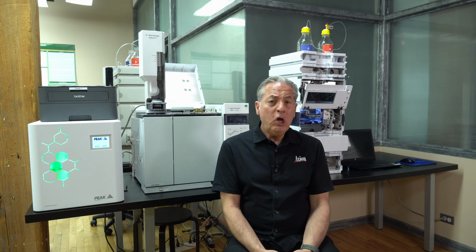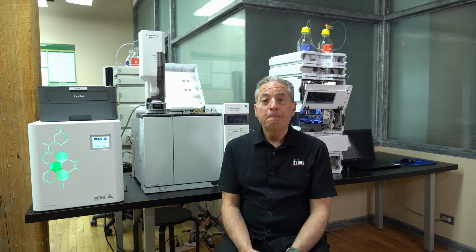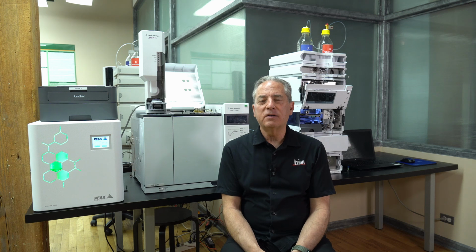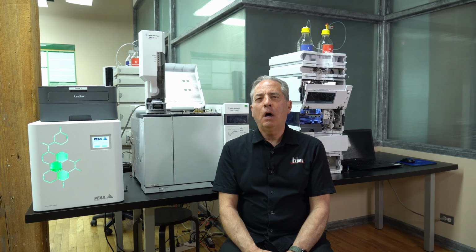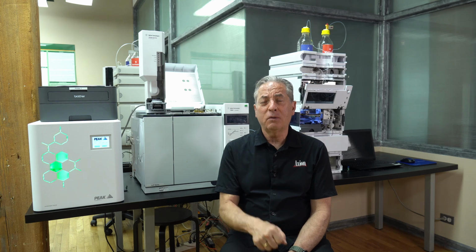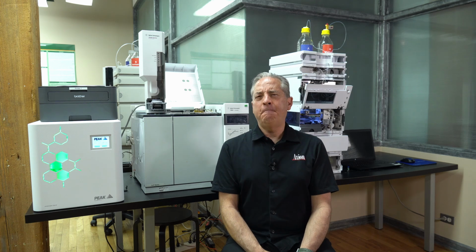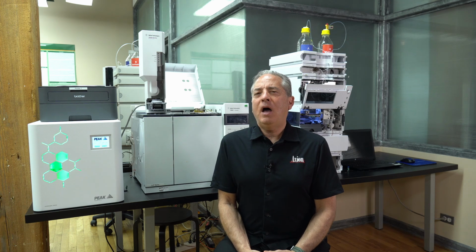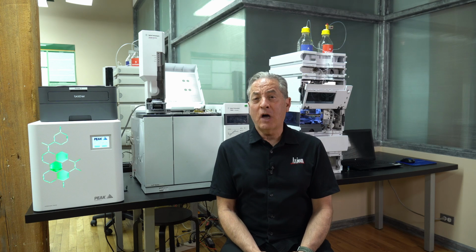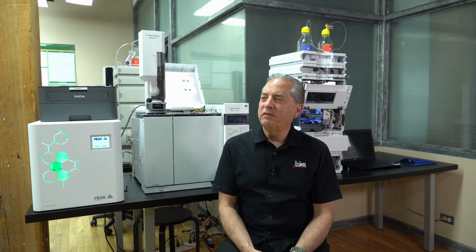Now in the LC world, we worry about the solvents. We're using acetonitrile, we're using methanol. They're both poisonous. Methanol, if you drink it, causes blindness, then causes death. So don't drink the mobile phase in the HPLC lab. But we do think about where we store the solvents. I'm still a big fan of carrying around the solvent bottles in a big rubber bucket to prevent us breaking a gallon jug. In terms of the fumes getting into the lab, I think there's sort of mixed views on this. From the one perspective, you'd say the solvents really don't evaporate.